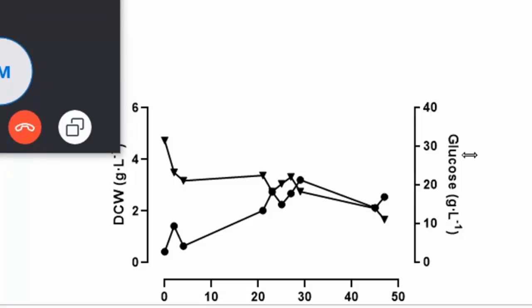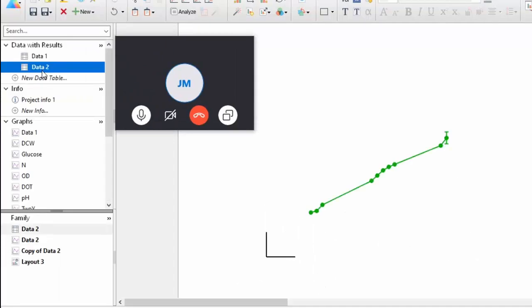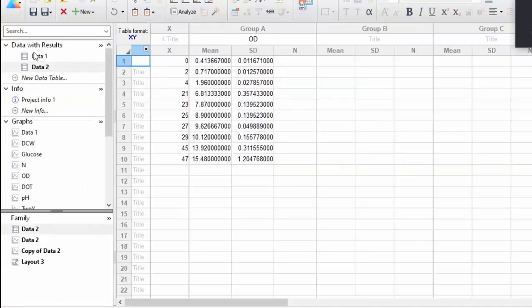And then it adds the title, saying add y title, and then you can offset. So this is with 2 y. And then for multiple y, you've got to do some tricks because it's not so straightforward. So for that, I took, let's say, OD2, data 2.